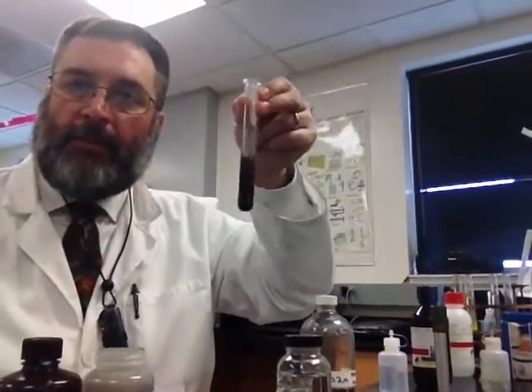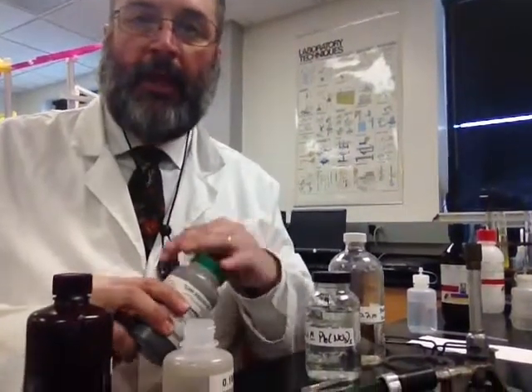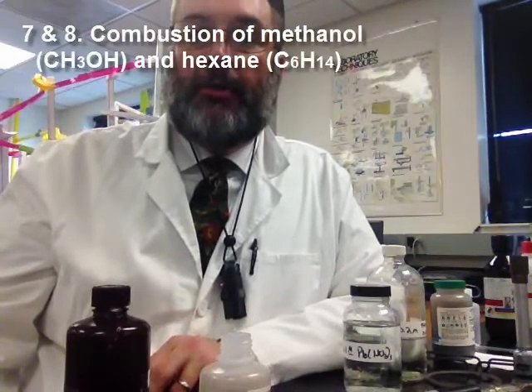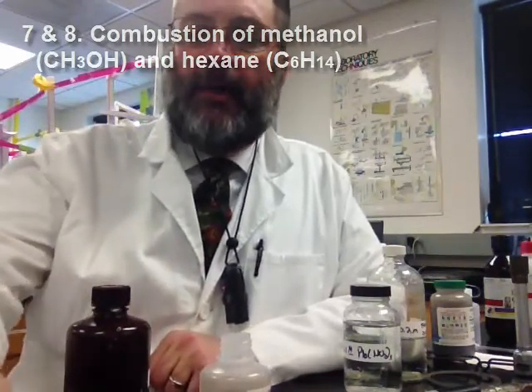Eventually, all that sort of blackish color will settle to the bottom because it's just this black powder, MnO2. And I will have in that tube exactly as much MnO2 as I started with because it's a catalyst. It just speeds it up. It doesn't get used up. Okay? All right, I'm going to show you a couple more quick ones. These are combustion reactions that I'm going to show you. And I'm going to show you the difference between two different kinds of organic compounds being combusted.